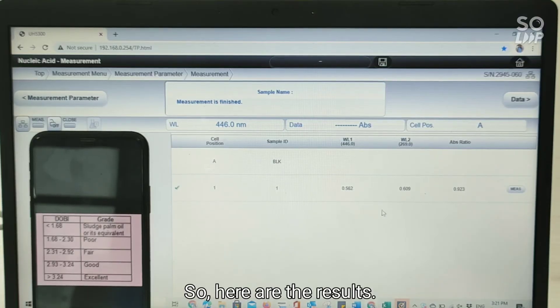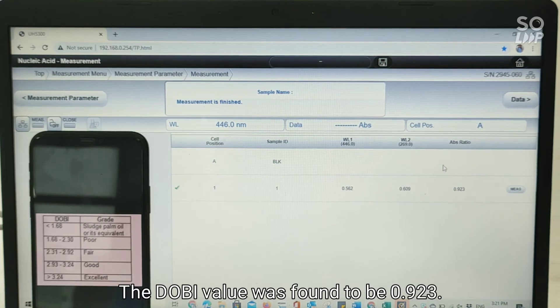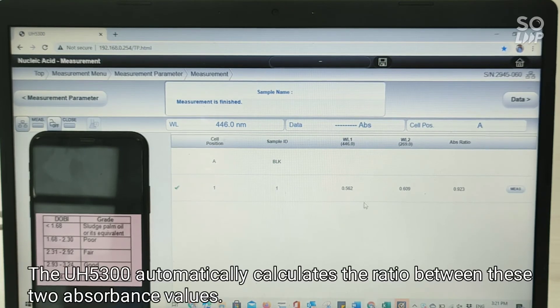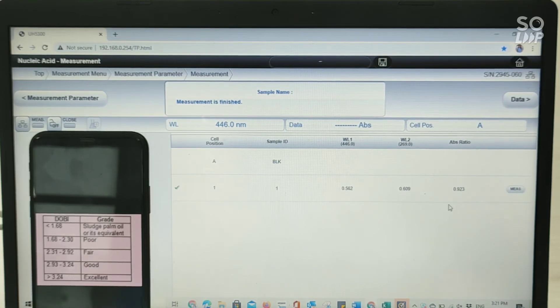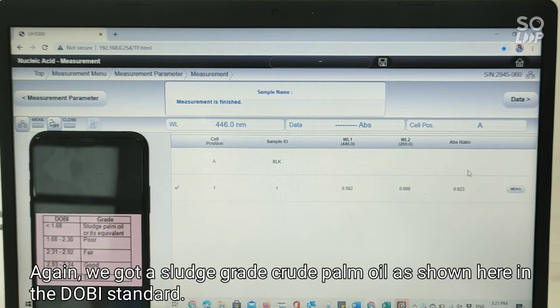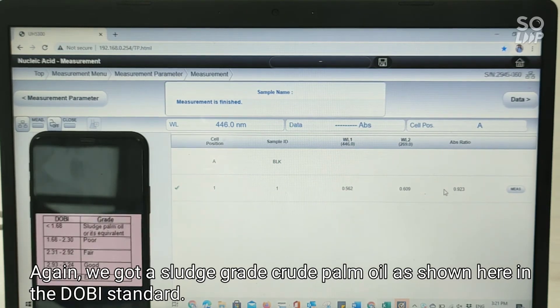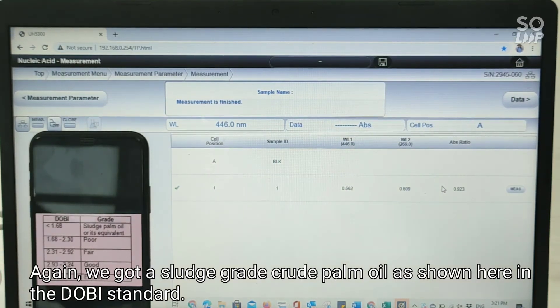Here are the results. The Dobie value was found to be 0.923. The UH 5300 automatically calculates the ratio between these two absorbance values. Again we got a sludge grade crude palm oil as shown here in the Dobie standard.